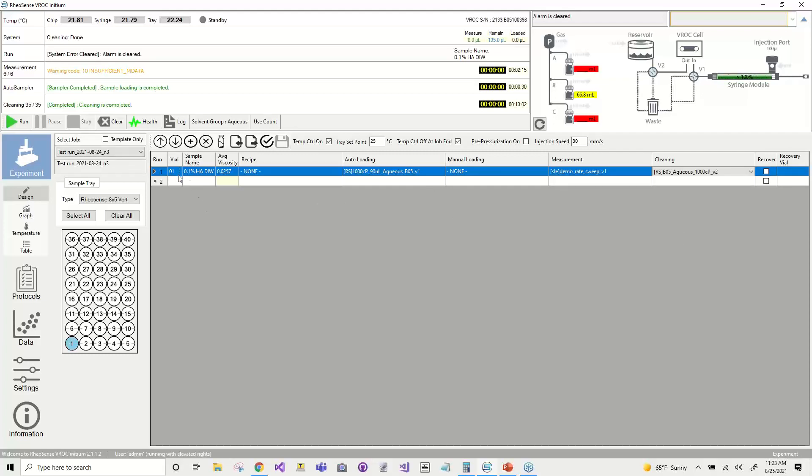The last thing is to specify a vial location. Right now we have vial one selected as the vial location, and you can see that in our tray over here. We also have the option for using a 96-well plate — you can use this dropdown menu and see the 96-well plate available here. The last thing I want to point out is the sample recovery box. After the measurement protocol is complete and before cleaning starts, the auto sampler will pick up your sample from the test syringe and place it back into the vial of your choosing. That way you can use your sample for other instrumentation if you're limited on sample volume.